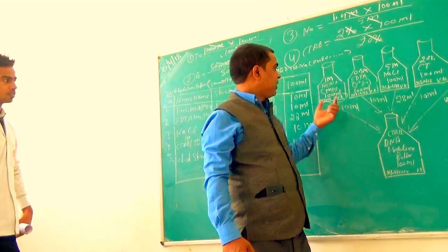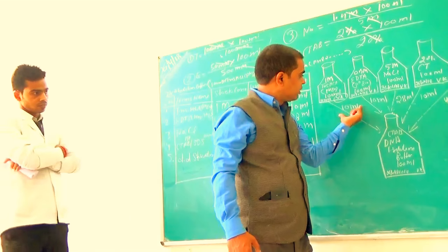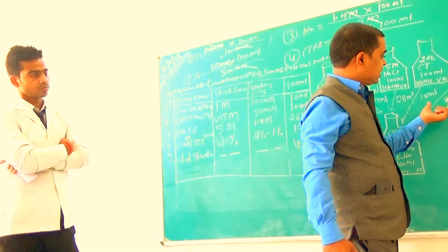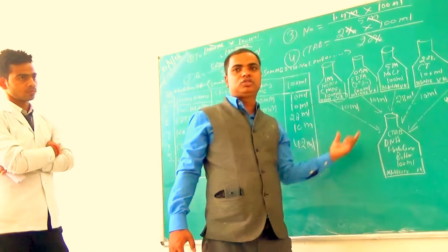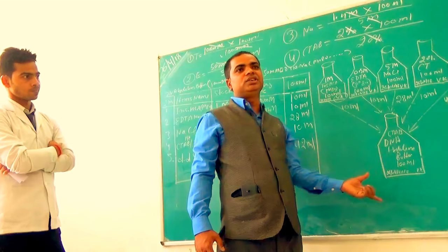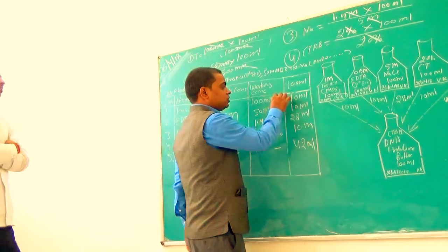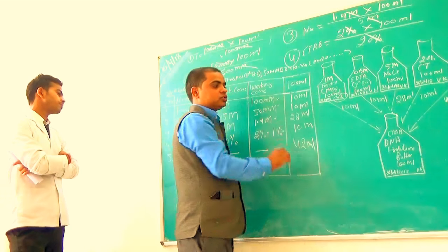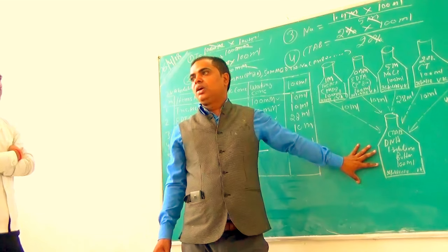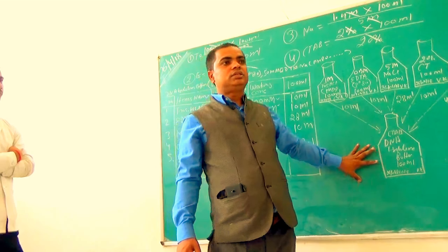We take 10 ml Tris, 10 ml EDTA, 28 ml NaCl, 10 ml CTAB and 42 ml water mixed together in one bottle. All the concentrations are according to the working solution, and this solution can be used for plant DNA and fungal DNA isolation.